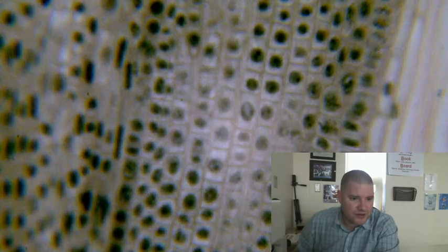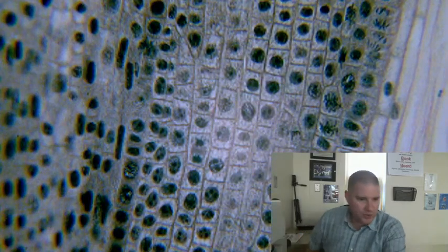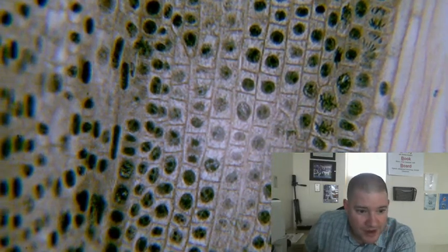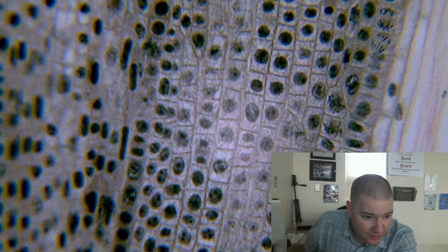There we go. There's some good high-powered shots happening. How we have things going on. All right, so there you can kind of see a couple of them going on in action.